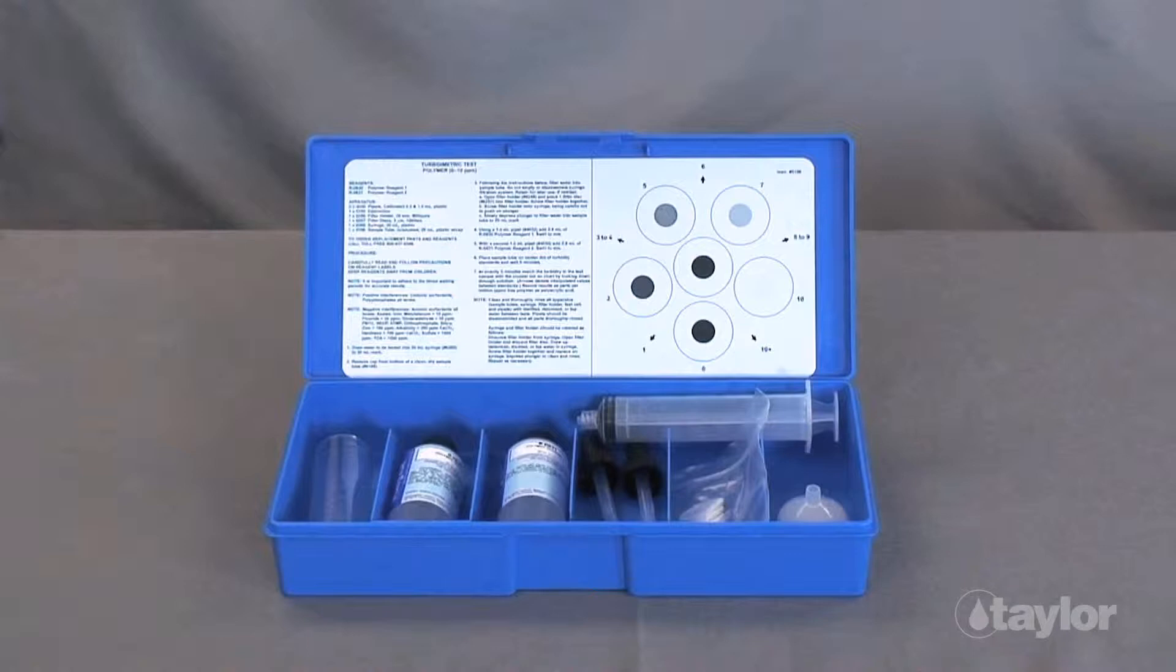The test method is turbidometric, meaning the degree of cloudiness that develops in a test sample will be proportional to the amount of polymer in the water. Results are read as parts per million polyacrylic acid.